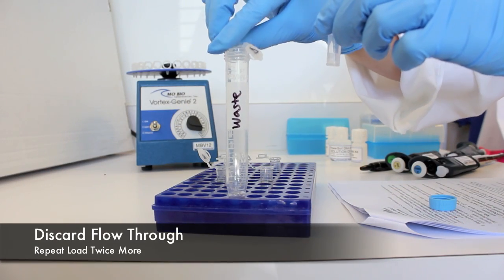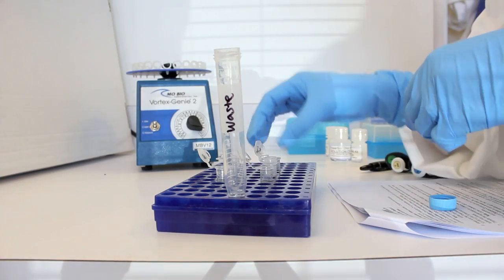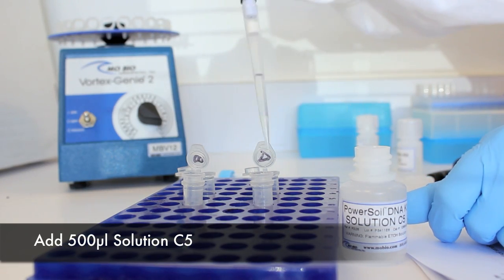Discard the flow-through into a waste container. Repeat these steps until all of the remaining supernatant has passed through the spin filter. Add 500 microliters of solution C5 and centrifuge.